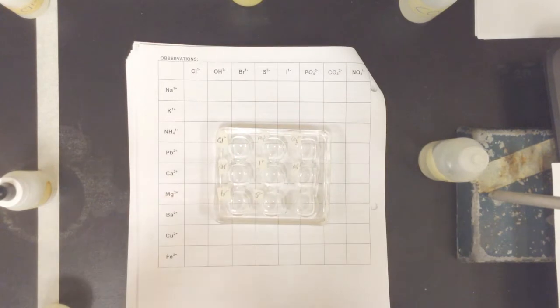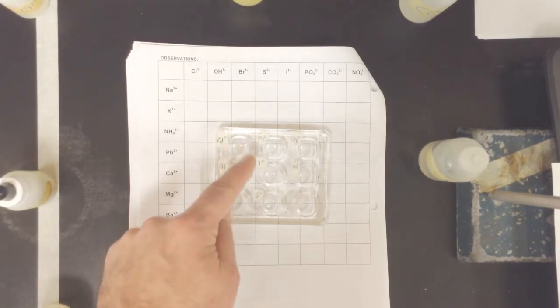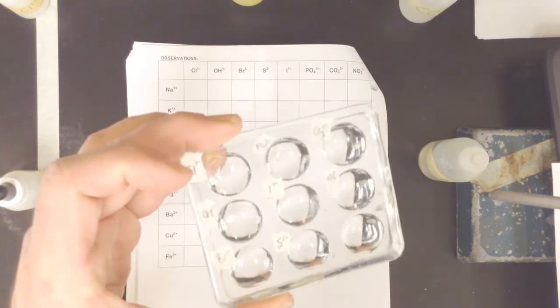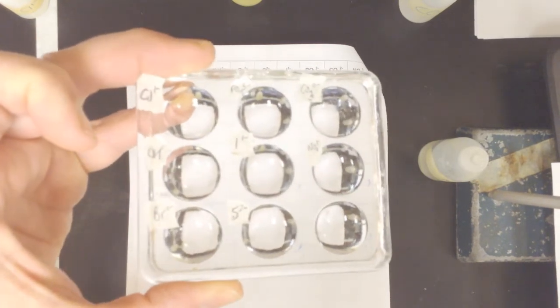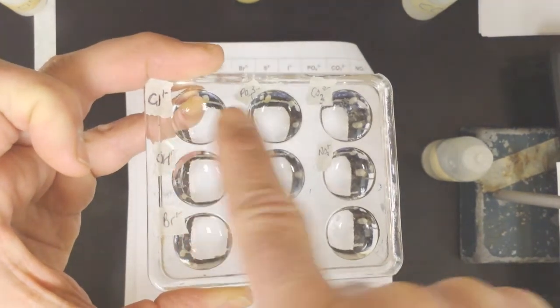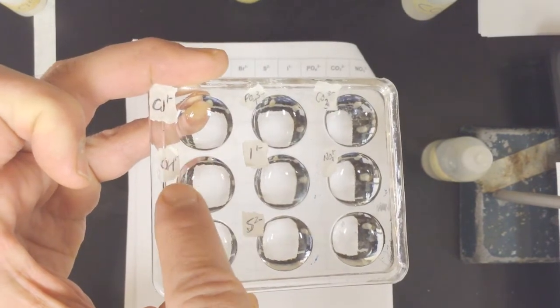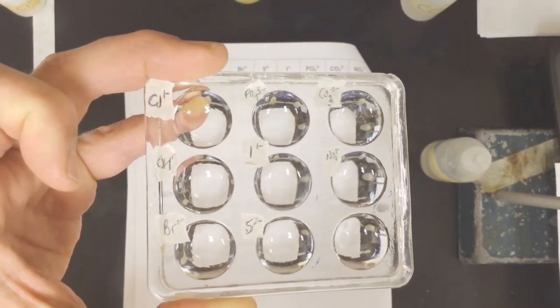I've got a reaction plate, and what we're going to be doing is adding anions in. Here's my reaction plate, and you can see I've started to label all of the different anions that are going to go in each one of these holes. What we're going to start with is putting one of the cations in each one of these wells. Then we're going to add a drop of each one of these anions into the wells. Okay, let's do this.